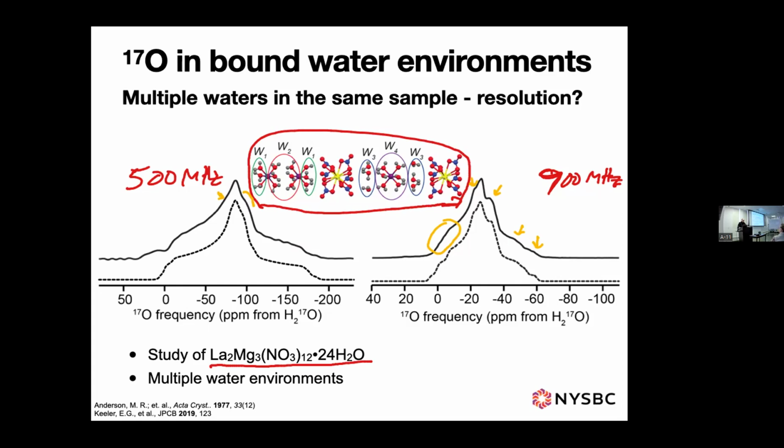So this was a sample that was floating around before I started. Vlad, Michaelis, and Bjorn Berzelius were working on it for various reasons. Bjorn was always interested in doing something with a metal center for DNP. So it was around, we knew how to deal with it. Vlad had already labeled it with oxygen. It was a good test case.